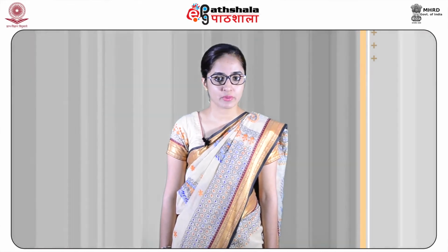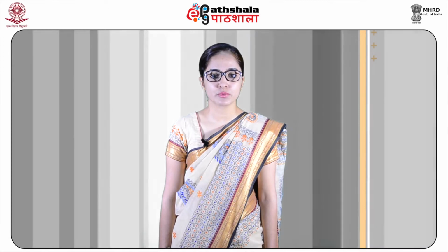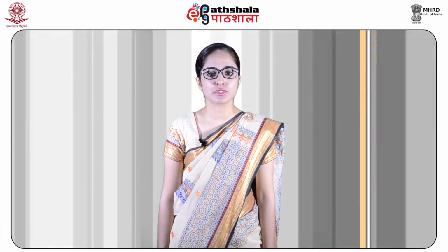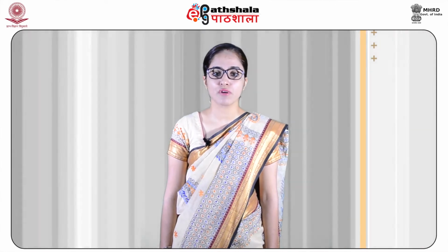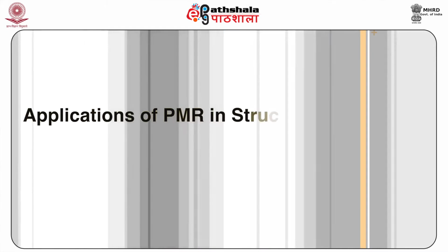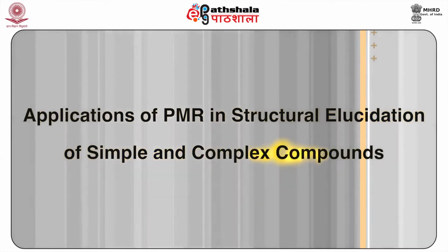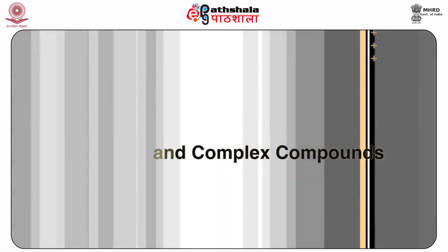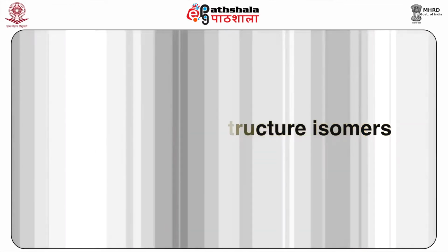Together with X-ray crystallography, NMR spectroscopy is one of the 2 leading technologies for the structural determination of biomacromolecules at atomic resolution. The following are some important applications of NMR spectroscopy used by an organic chemist to elucidate the structure of unknown organic and inorganic compounds. Now let us begin with some applications of PMR, that is proton magnetic resonance, or NMR in structural elucidation of simple and complex compounds. We will first in this segment take up the identification of structural isomers.